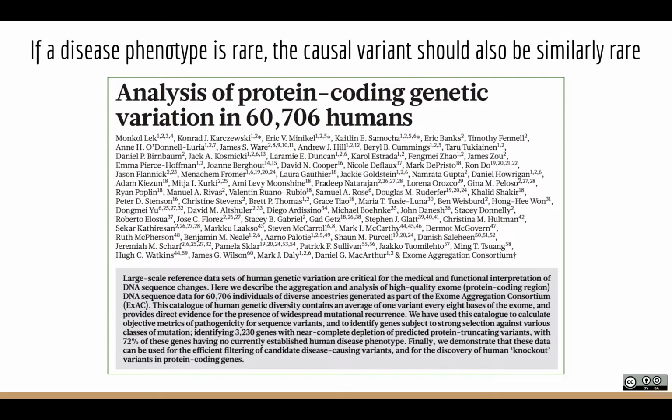Okay, so now I want to transition into another fundamental concept in this type of analysis. Developmental disorders are very rare. So if we find a variant in a gene in our proband that makes sense, would we believe it if we knew that that variant actually exists in 5% of human chromosomes? Would we still think, if we were given that information, that it's interesting? Probably not if the phenotype occurs, say, in 1 out of 50,000 live births, right?